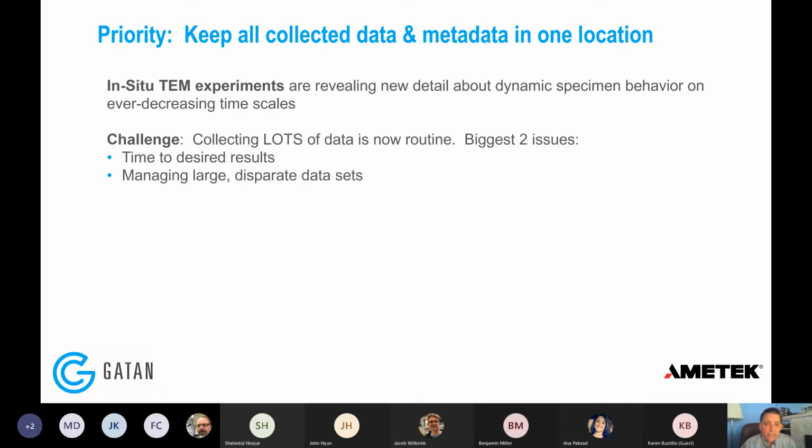The challenge is that, ironically, people for a long time said, well, we don't have the ability to collect the data that we want, and so there's nothing we can do. Well, now we've removed that particular obstacle, and we see what the next problem is, peeling the onion. The next problem is that having a lot of data is now routine. It's quite simple to go into a lab that's equipped with one of these high-speed cameras, for instance, and generate hundreds of gigabytes, if not a terabyte of data. You can have a couple terabytes in one day.